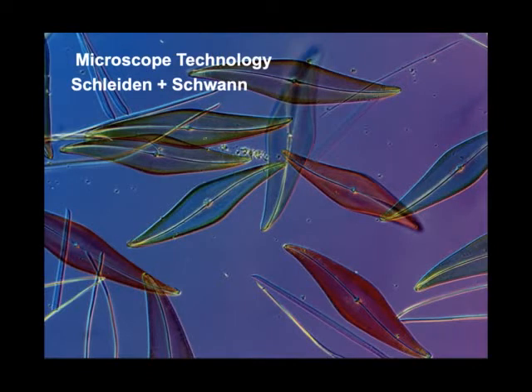The second type of microscope came along about the time that Schleiden and Schwann were doing their research on plant and animal cells. It was a compound microscope, which meant that it didn't have just a single lens. It actually had a pair of lenses or 3 lenses, and each lens magnified what the previous lens was seeing.